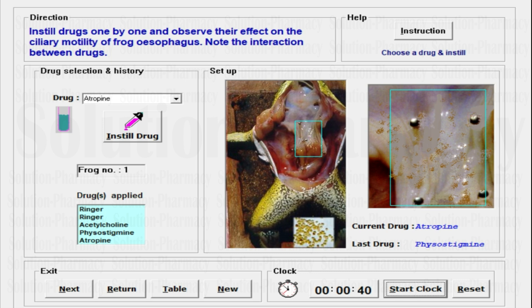I hope you have understood the basic point and principle of this experiment. If you click the Table button, you will see a table, but that table is a common, ready-to-use fixed-parameter table showing how to format your own table — click it when you want to understand how to plot a table. This was a simple yet very important practical for your syllabus, including B. Pharmacy. Thank you so much for watching this video. Namaskar. Take care.